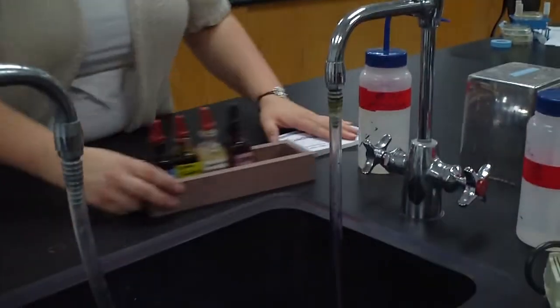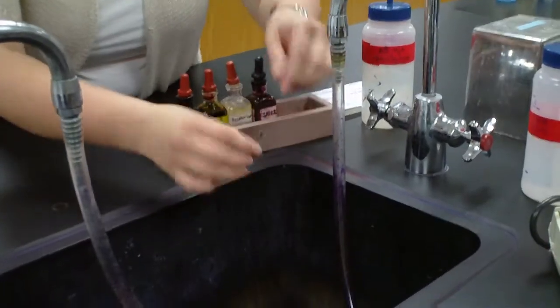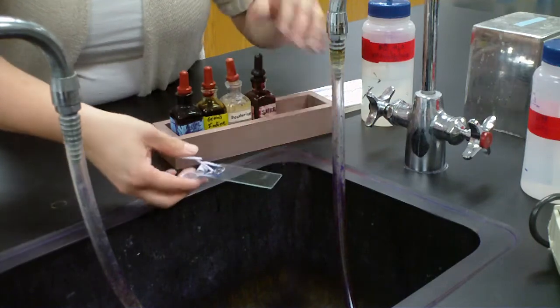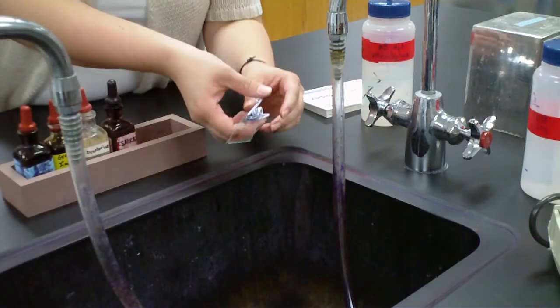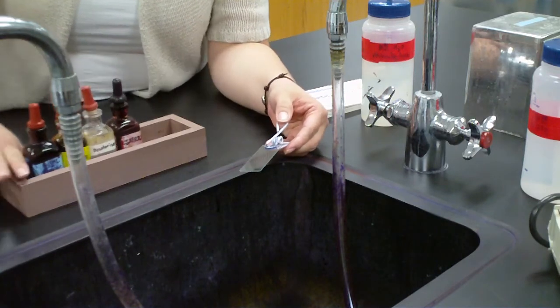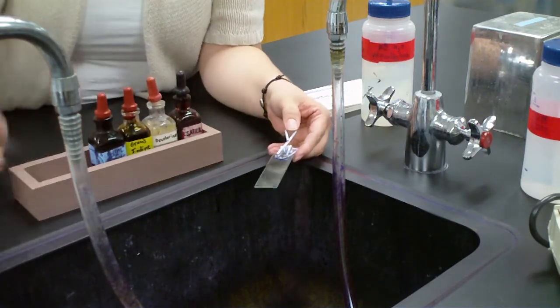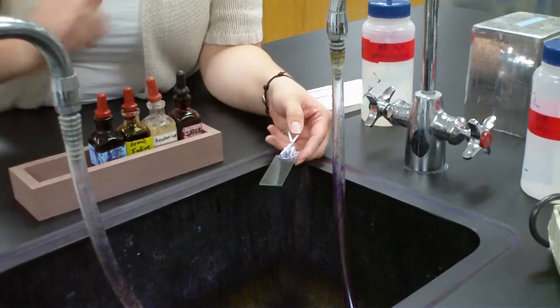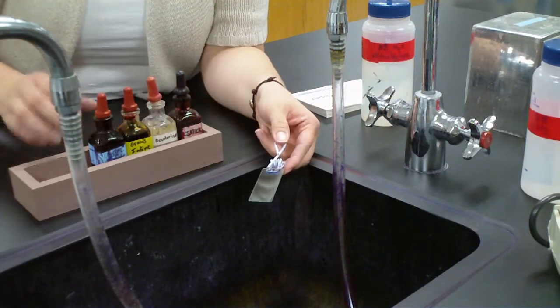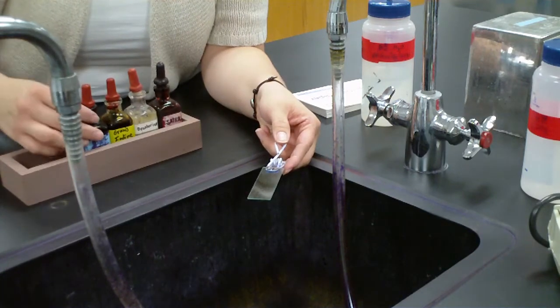Okay. So over here at the sink, I've got my slide, and I need to put my clothespin on there. Staining labs get pretty messy, so you want to make sure that if you wanted to bring an apron or something like that, you could do that, and just make sure that you're not getting any of that dye on your clothes. So I'm over at the sink and I've got 1 slide. I would do 1 slide at a time instead of trying to do both at the same time.